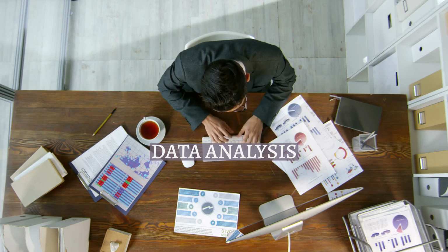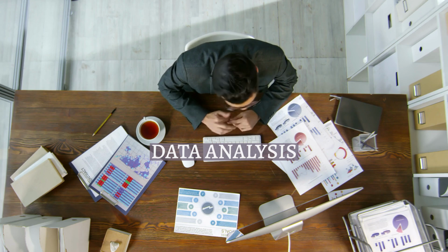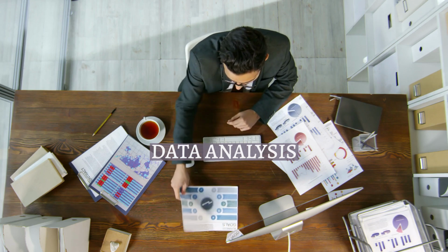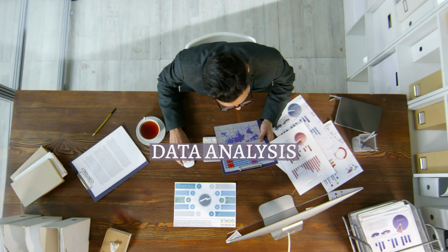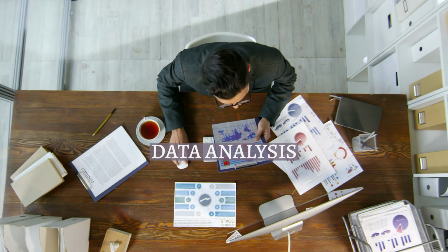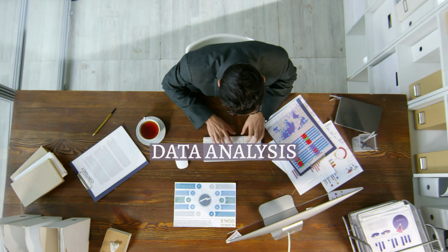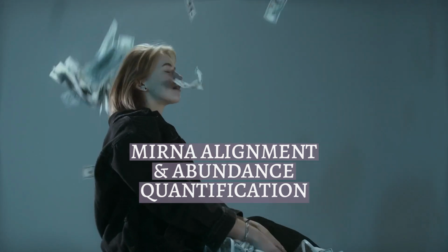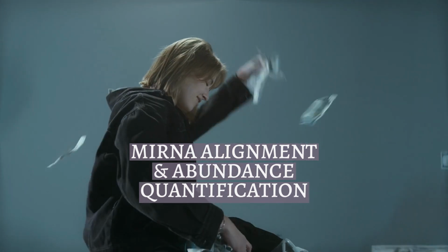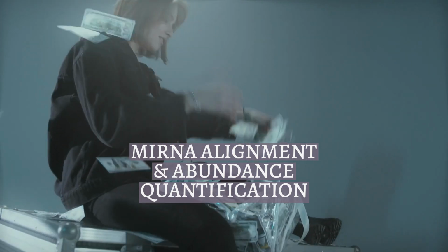As we progress through this video, let's now turn our gaze towards data analysis. Central to miRNA-seq data analysis is the ability to 1. Obtain miRNA abundance levels from sequence reads, 2. Discover novel miRNAs, and then be able to 3. Determine the differentially expressed miRNAs and therefore associated miRNA gene targets. Now, let's dig deeper into miRNA alignment and abundance quantification and unveil the hidden treasures it holds within.